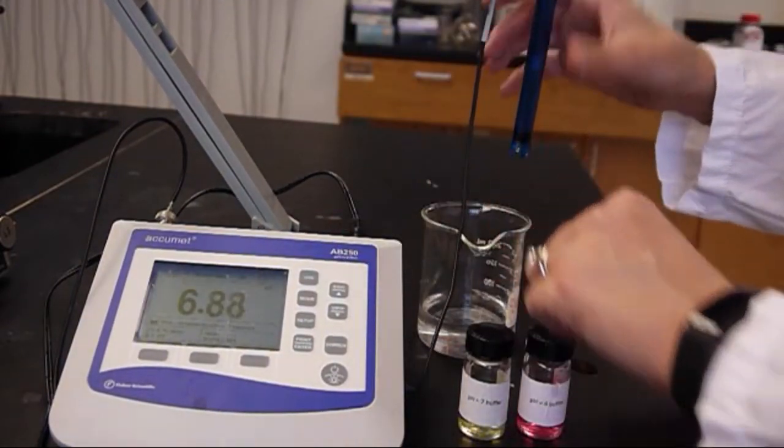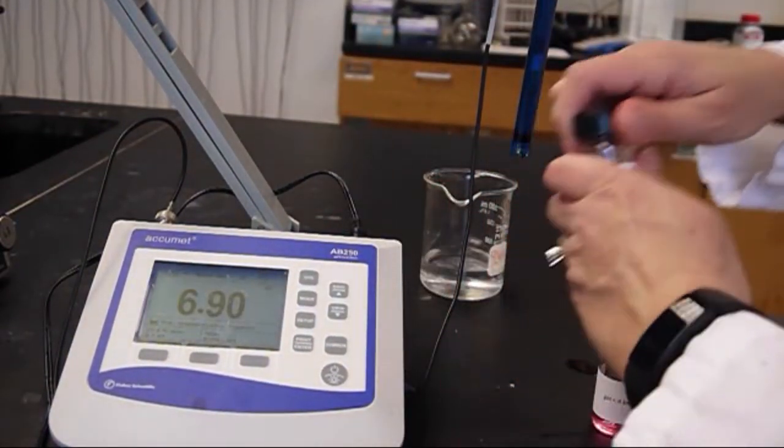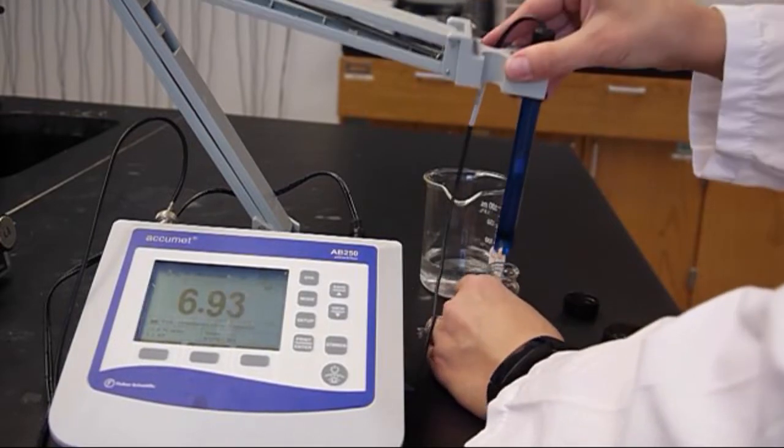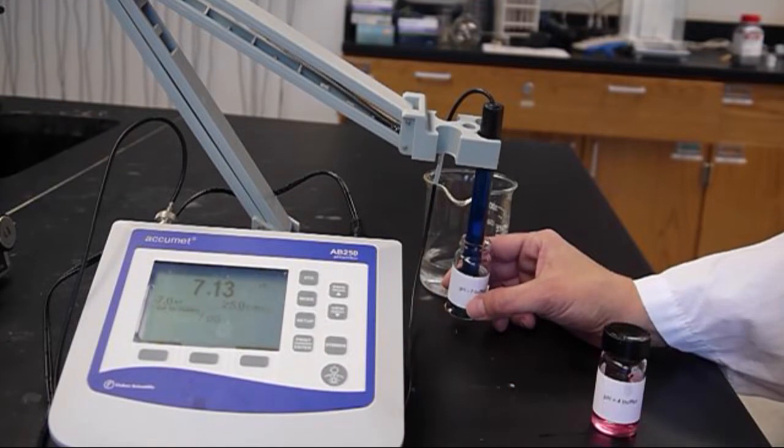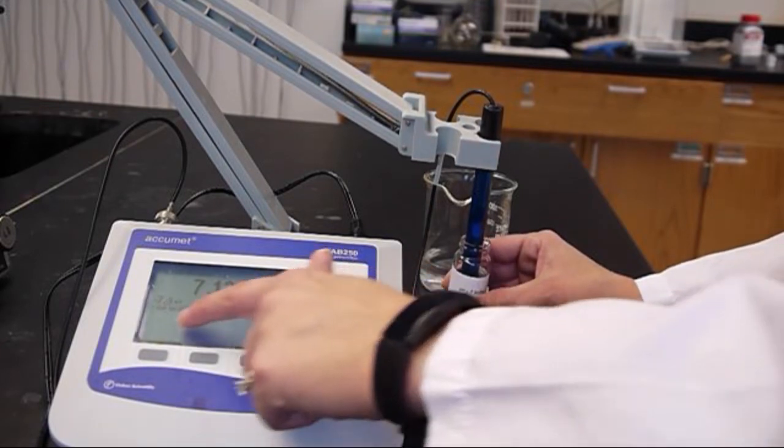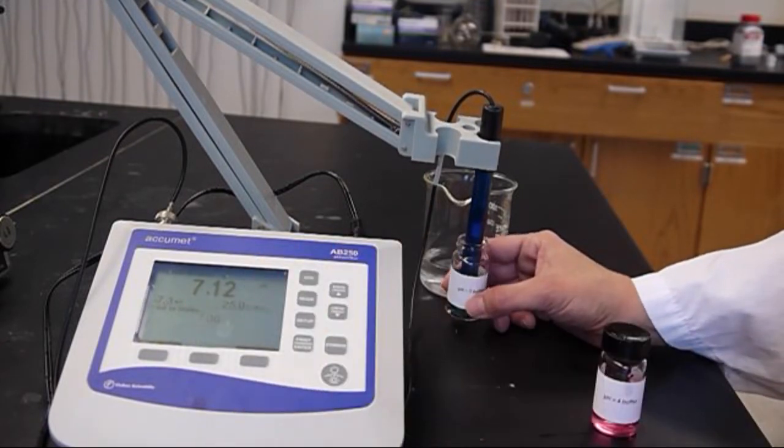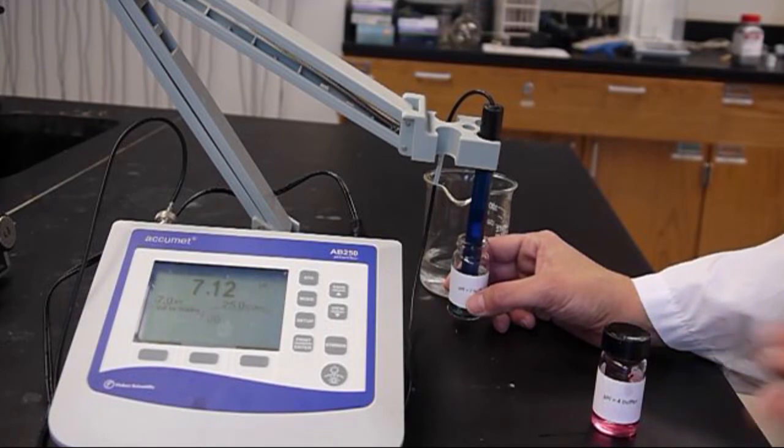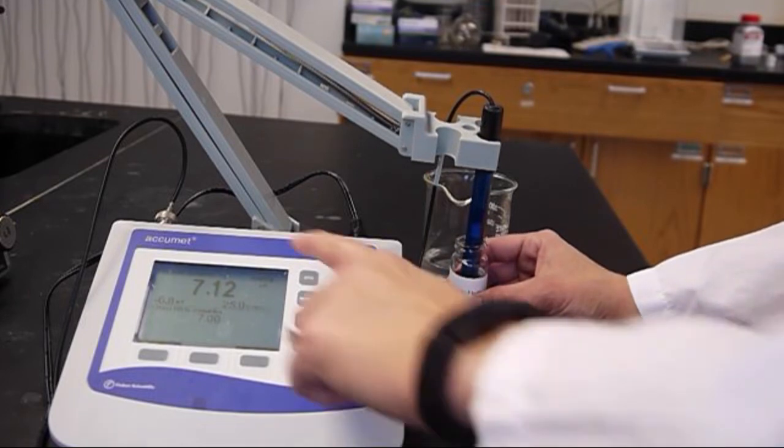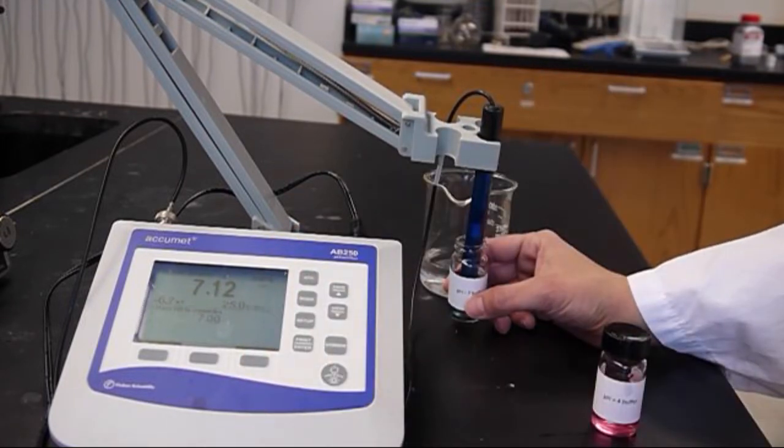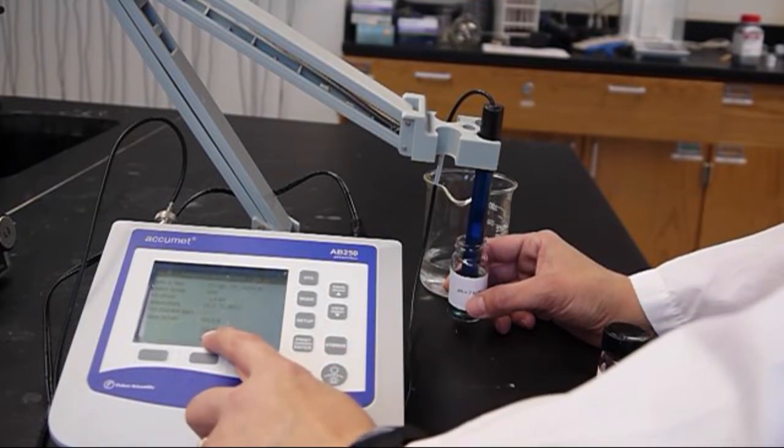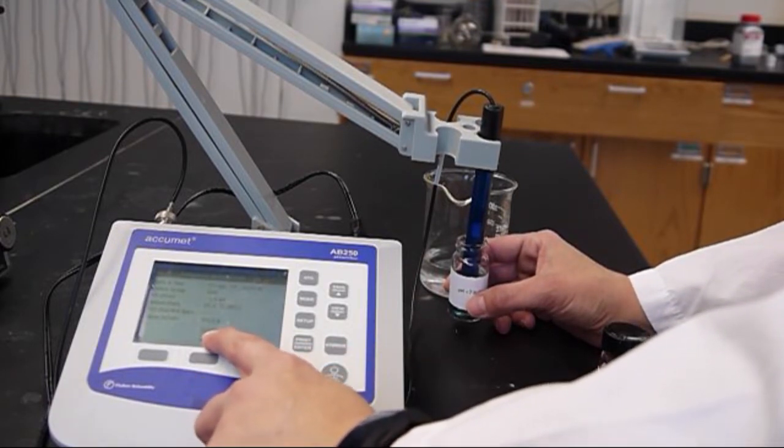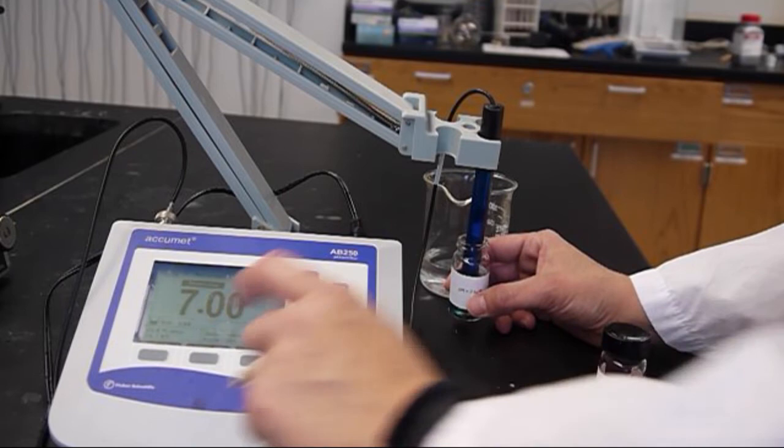So in order to calibrate let's first place our pH electrode in the pH 7 buffer and we'll press STD for standard. And right now it says it's waiting for stability. This pH meter will tell you when it has reached a stable measurement and at that point I see it says stable here. So now we can press STD to standardize and we'll have our pH 7 standard depicted there.